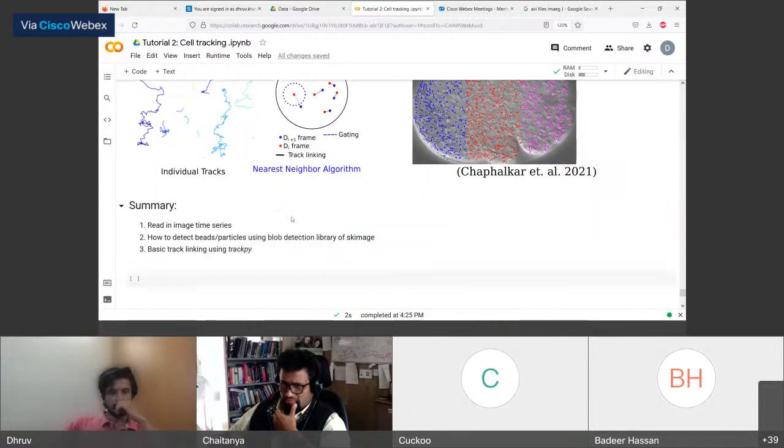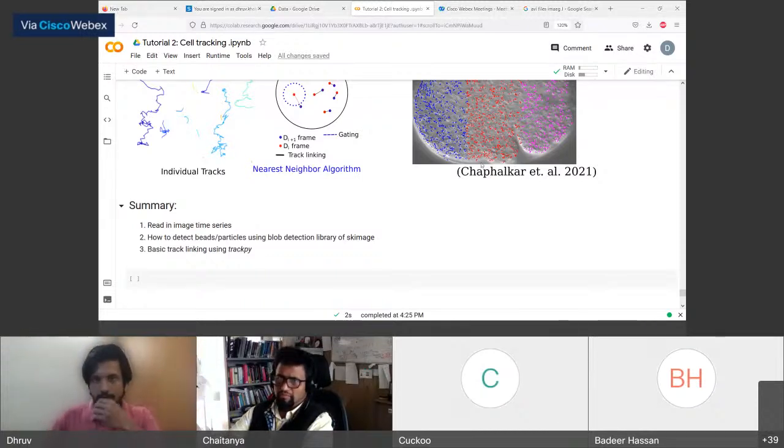So the summary of this talk would be: in Python, how you can read and display images, how you can apply different types of blob detection and filtering modules, and how you can track these detections in TrackPy. So if you have any questions, you can ask.